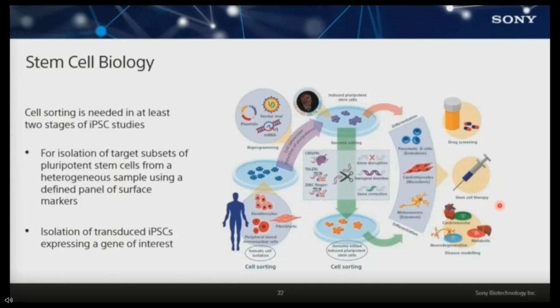But what I've used this system for is really disease modeling, mechanistic studies. You get those isolated, purified, defined cells, and you tease them out of a complex system. And then you can break that system down into its bits and pieces and study, maybe how to modulate a response or mitigate a response.